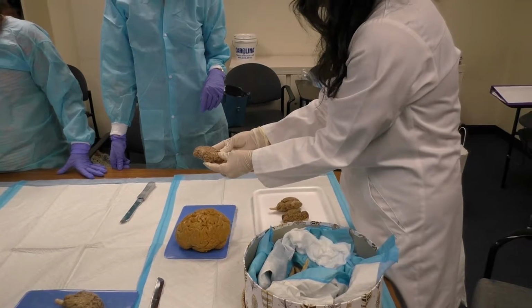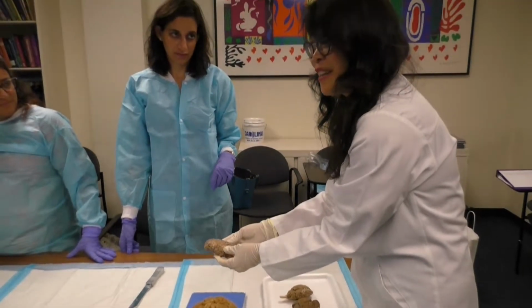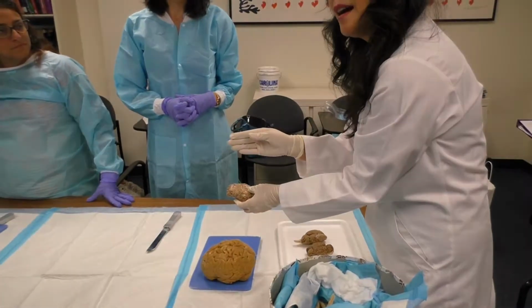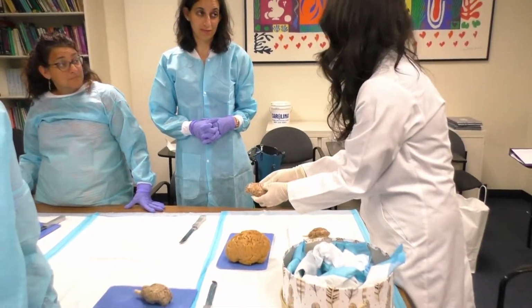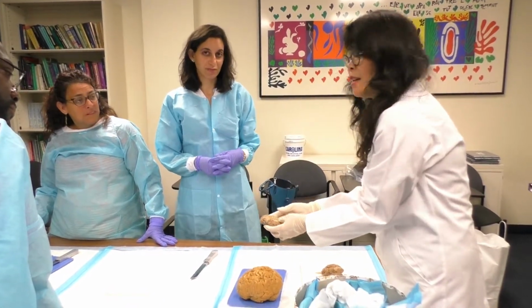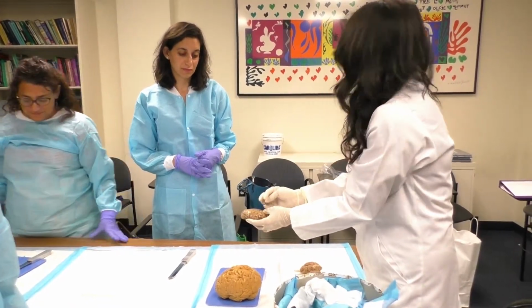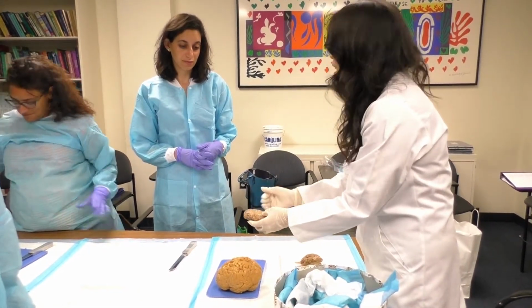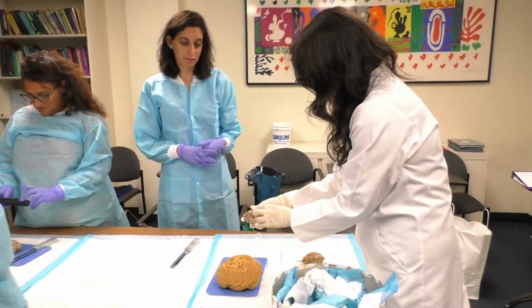Actually, what we know is that the sheep visual system is very, very advanced, such that individual sheep can recognize all other sheep in their flock and discriminate them from other sheep that are not in their flock. It's actually quite a developed system, and they do tests on visual acuity in the sheep. So that's one thing that the sheep seems to be even better than most organisms that need food and need to reproduce. Their visual cortices are particularly strong, and that's back here.